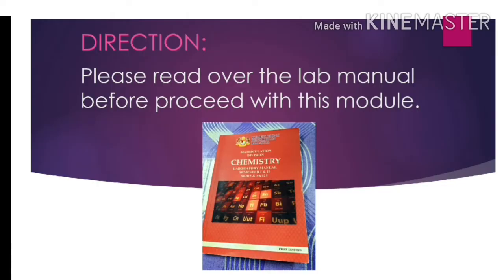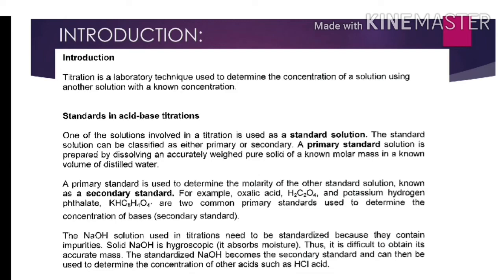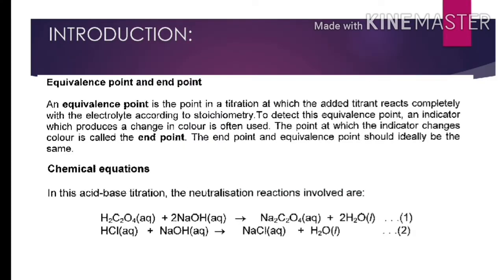But first, please ensure that you have read the lab manual for Experiment 2 before proceeding with this video. First, try to understand the introduction for this experiment. It contained explanation about what is titration, standards in acid-base titration, equivalence point and end point, and the chemical equations involved.